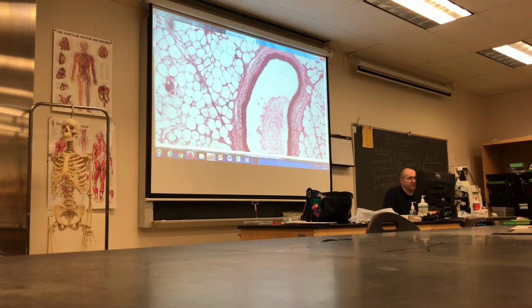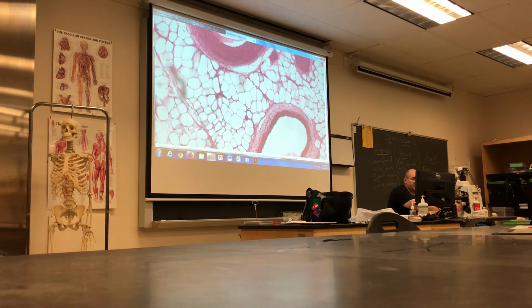This one has a bunch of blood still hanging out in it, right? That's what all this is here. And then the tunica externa coming off of that, right? So you see how different that tunica, let's see if I can get them both in the same shot here, right? Yeah. The tunica media, how much thinner it is on the vein versus the artery, right? And that's why you have that massive structural difference going on between them, right? It really is that tunica media lending itself to that overall difference in thickness going on between the two. So besides that, any questions?